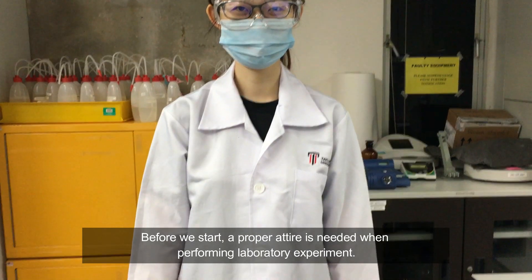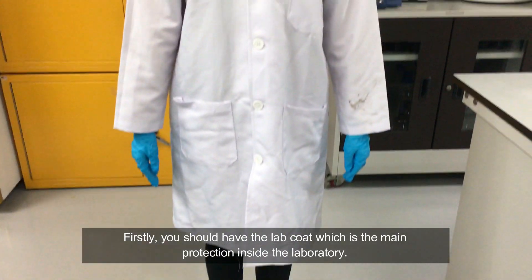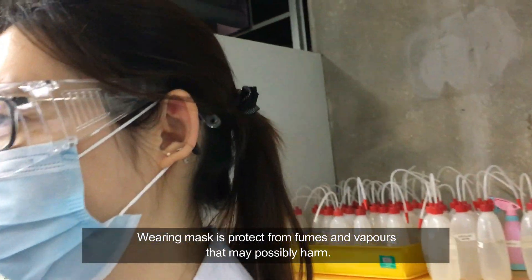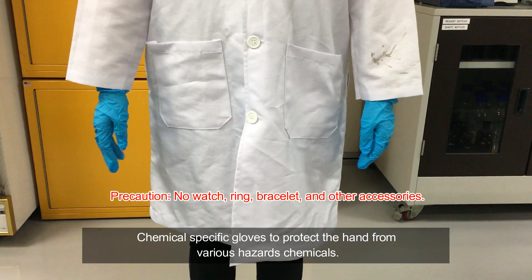Before we start, a proper attire is needed when performing a laboratory experiment. Firstly, we should have the lab coat, which is the main protection inside the laboratory. Next, wearing goggles protects the eyes. Wearing a mask provides protection from fumes and vapour that might possibly cause harm. Chemical-specific gloves protect the hand from various hazardous chemicals.